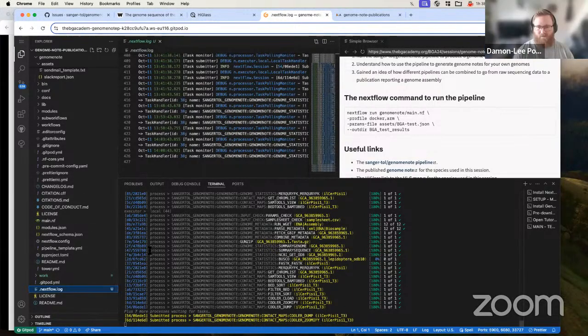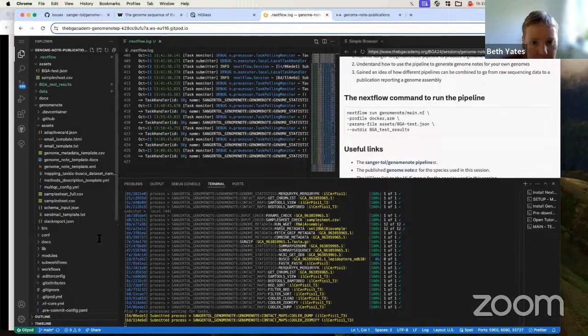Okay. So the pipelines, quickly, wait for Busco. Yeah, there are things I can show you, because some of the steps have completed, so I can show you some of the intermediate outputs that have happened.